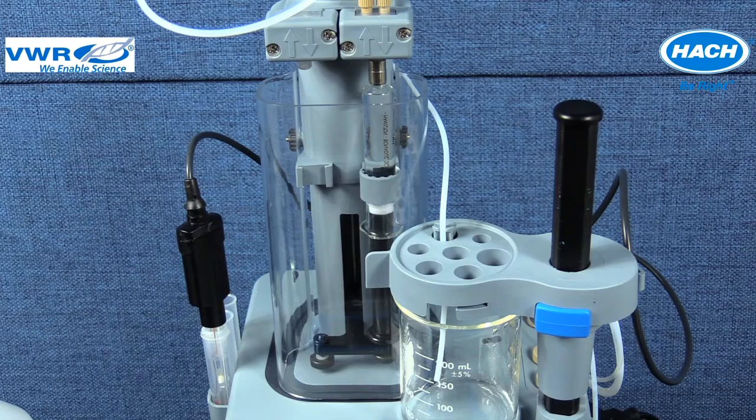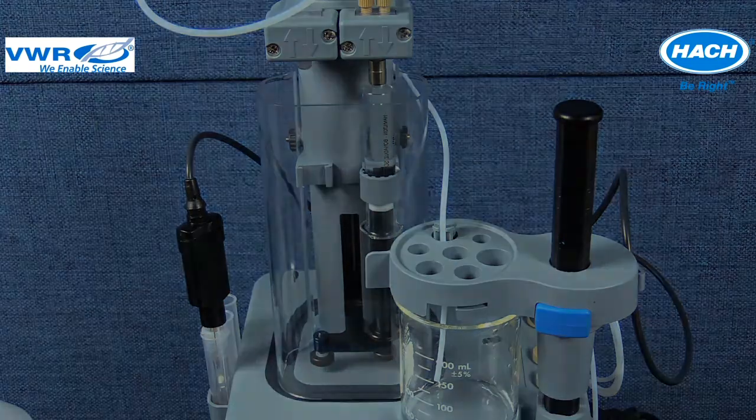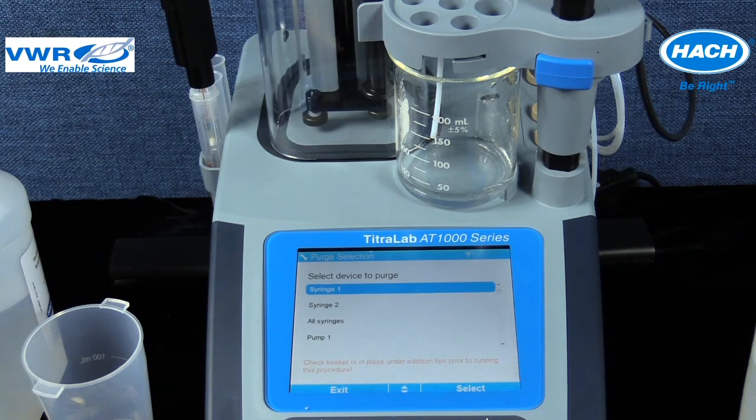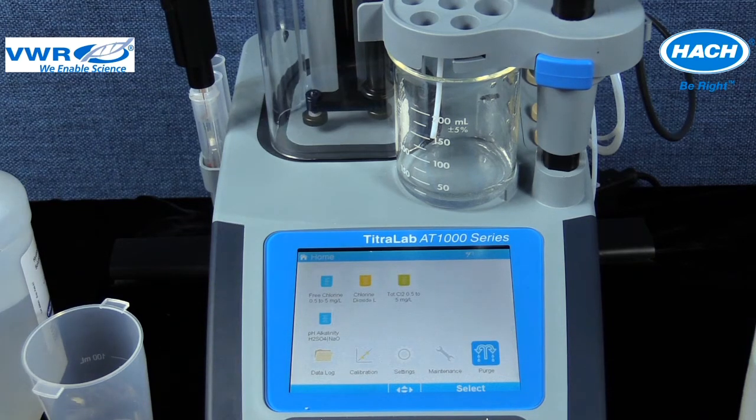After purge selection is complete, select OK and then exit out of the purge menu and return to the home screen. From the home screen, select the appropriate application from the choices previously loaded from the USB application key.